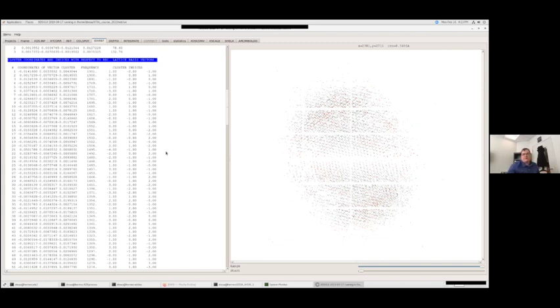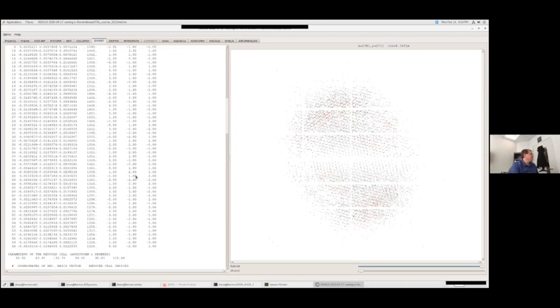Spot on integer values. Sometimes you'll see, oh, 2.05. That's fine. It's close to an integer value. It's not quite on it, but it's close, right? That would be fine. What you don't want to see is 1.63, negative 2.48, negative 2.25. If it's significantly away from that integer value, then something's gone wrong with the indexing. Okay, so that's another quick check.